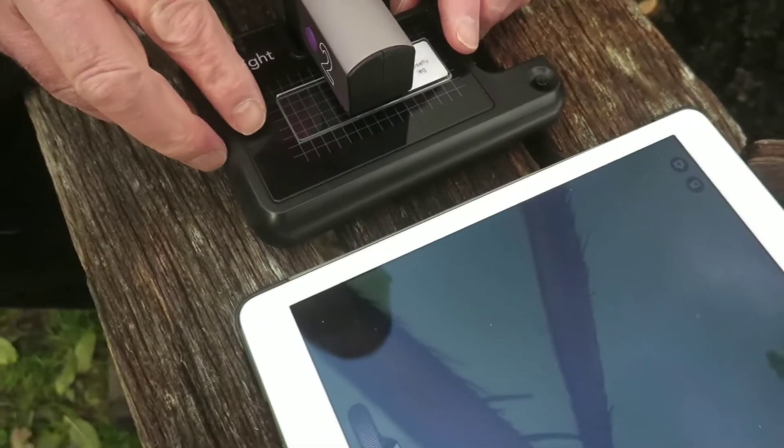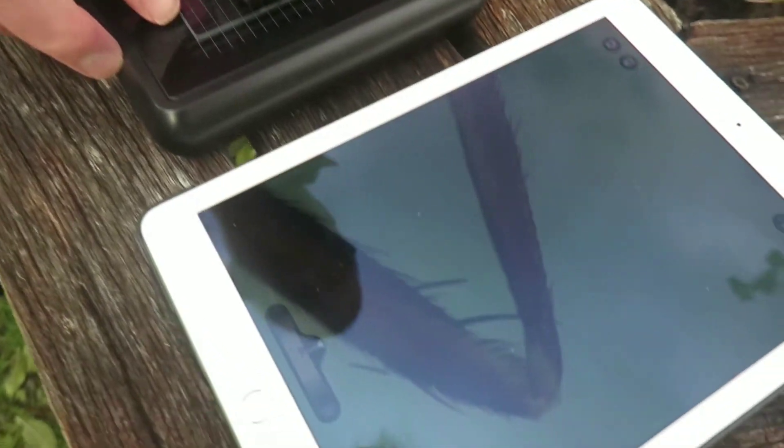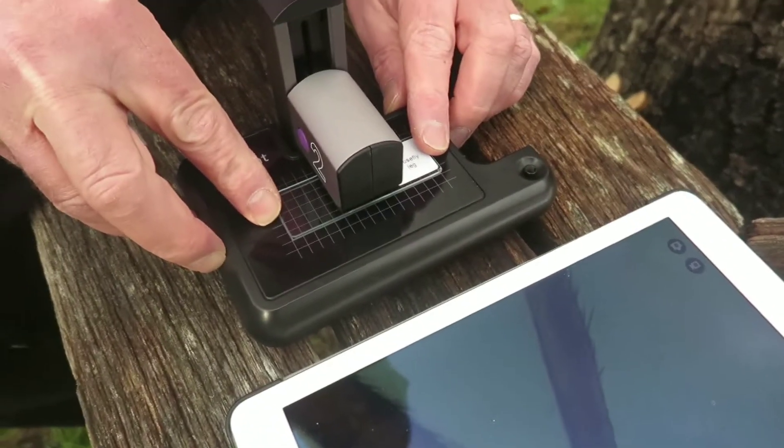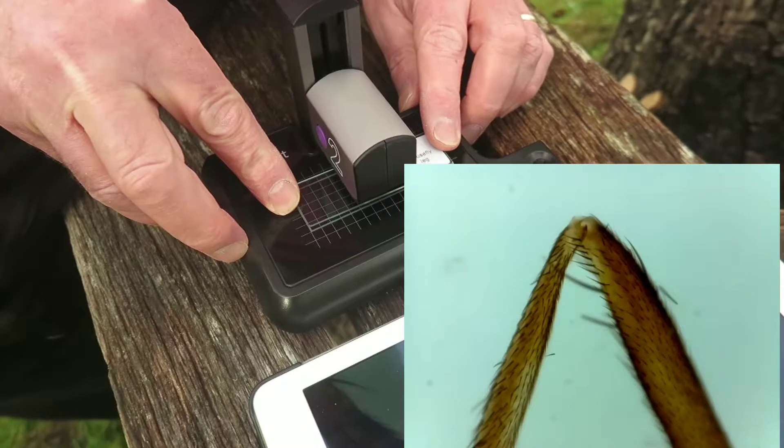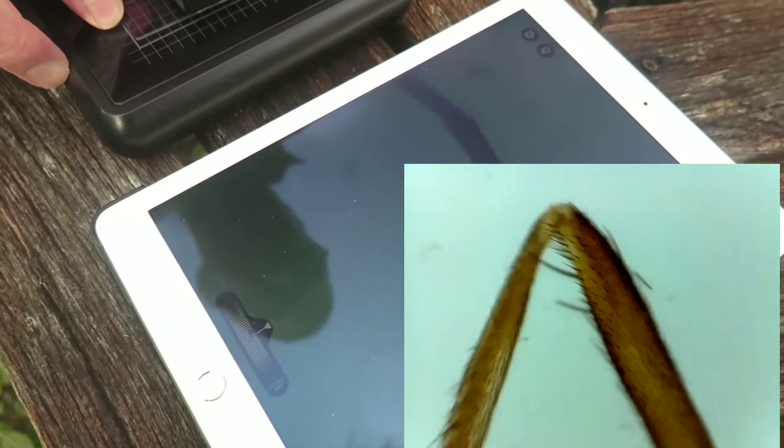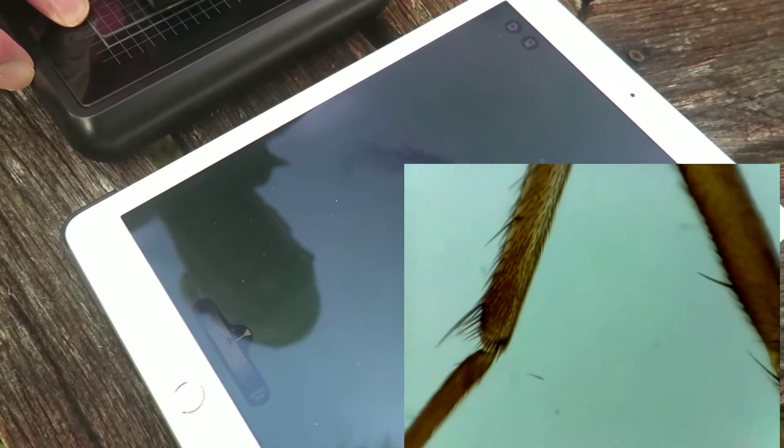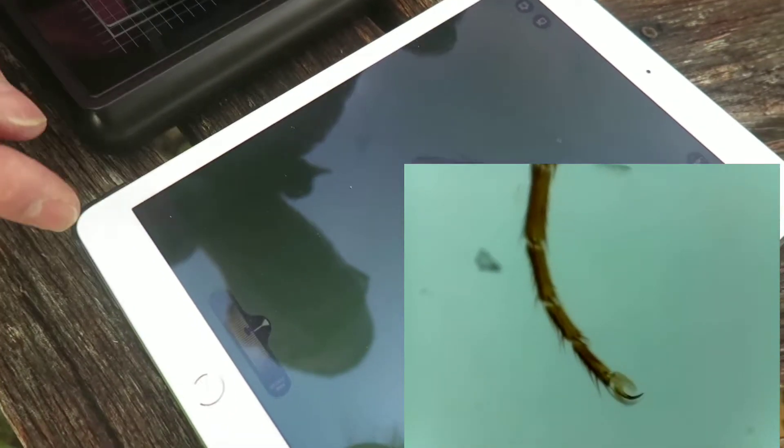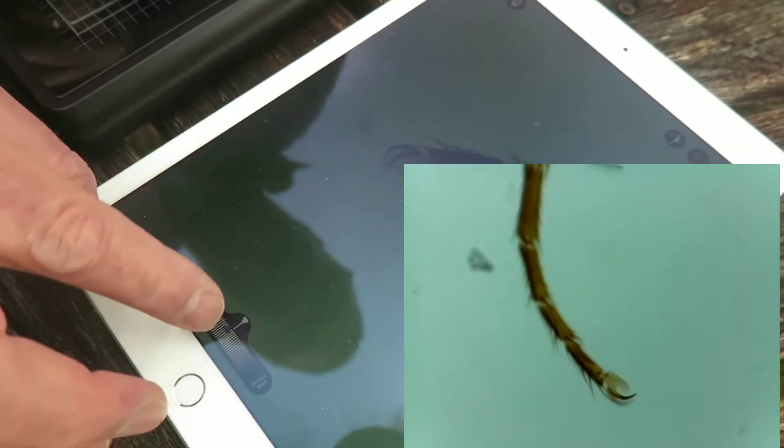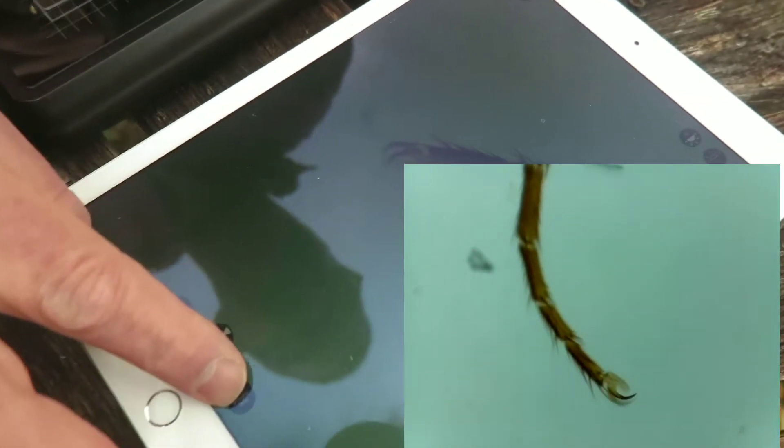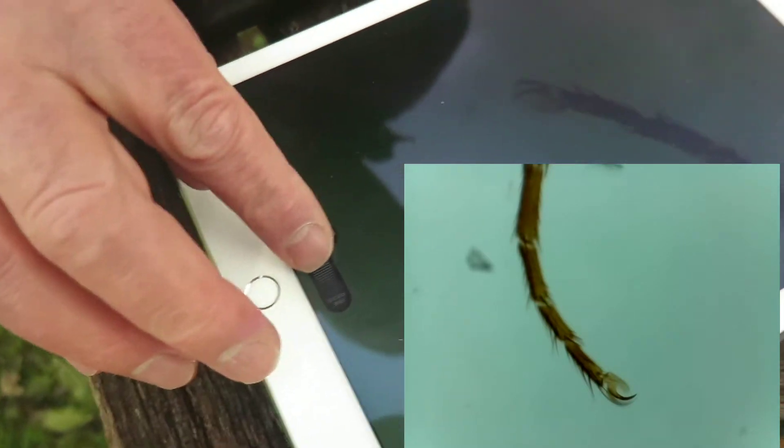And now we can manipulate the slide using my two fingers touching the stage and the end of the slide. I can go right down and look for the toe of the fly. There we go and of course because the toe is a little bit further away I'm going to have to adjust the focus again.